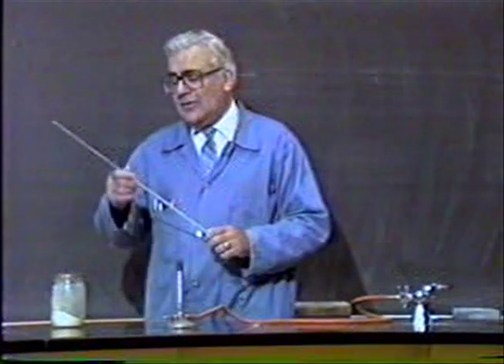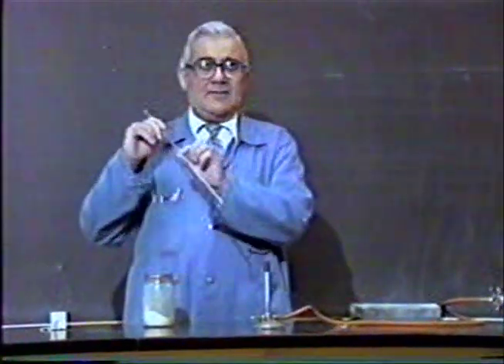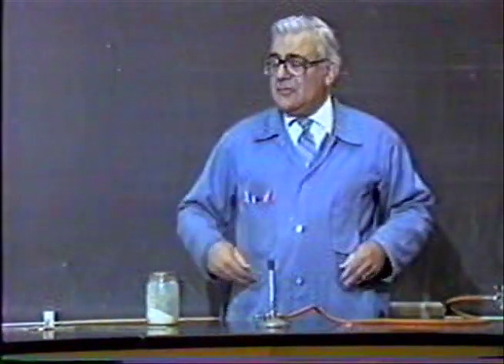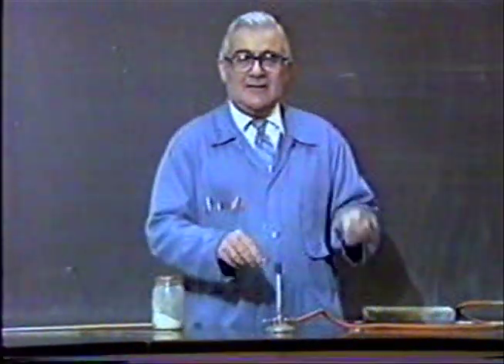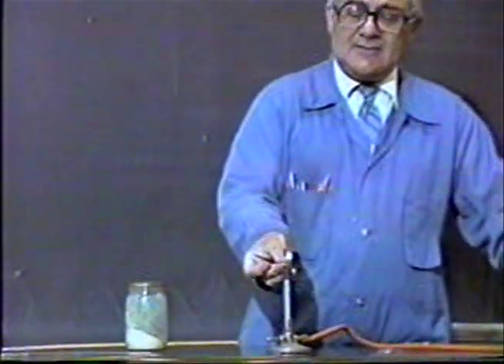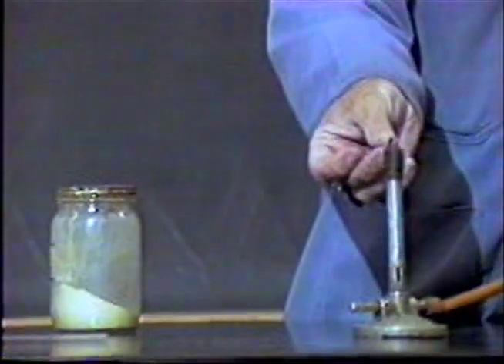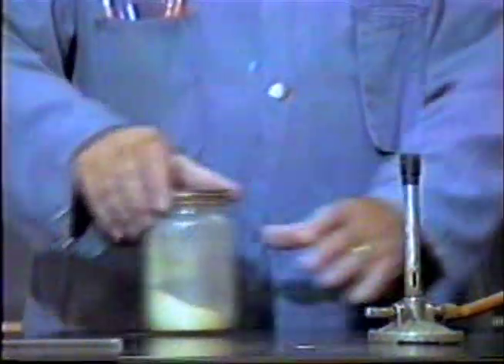These are the spores of the ground pine plant. What I'm going to do is use a glass tube, suck a little bit of this material up, and then blow it into the Bunsen burner and show you that I can make a pretty reasonable explosion. I don't want to make too good of one because, after all, we're in a classroom. So the first thing we'll do is attempt to light the Bunsen burner.